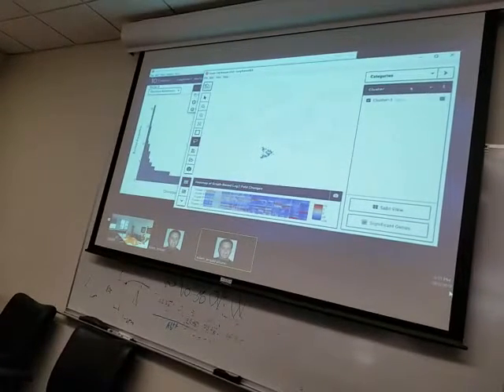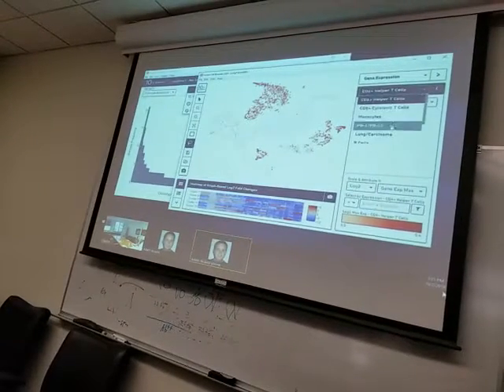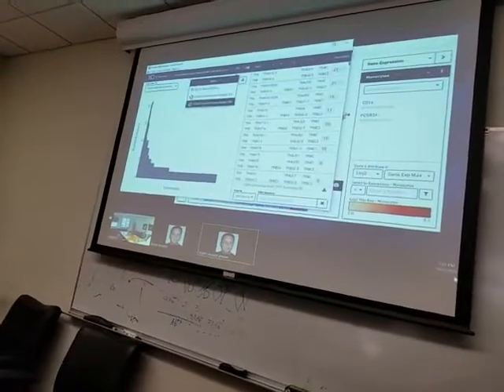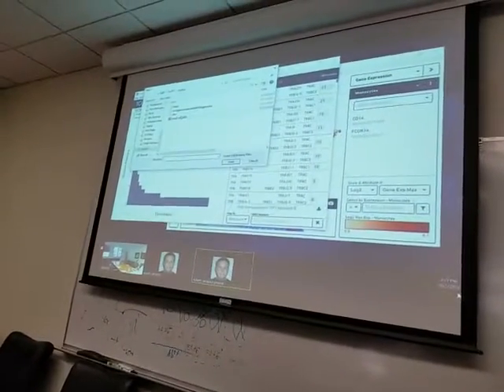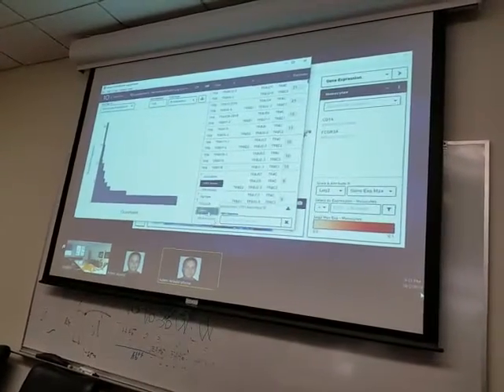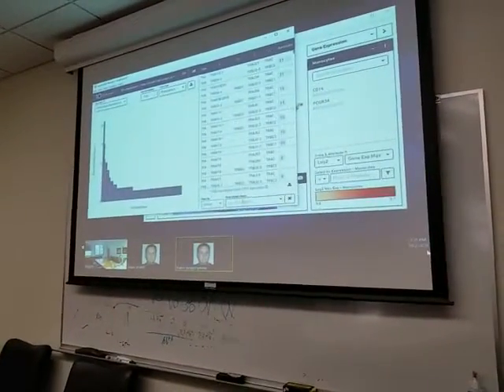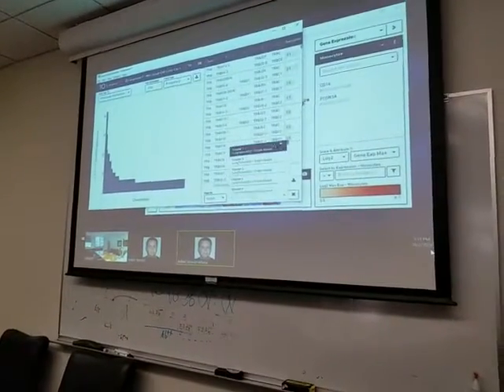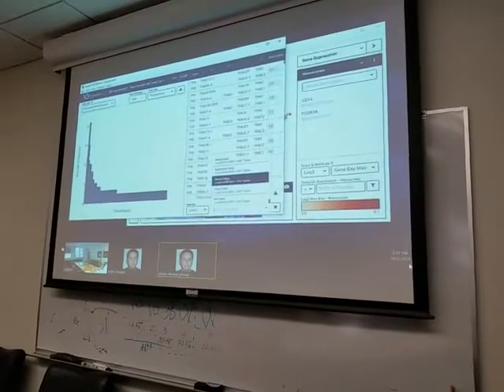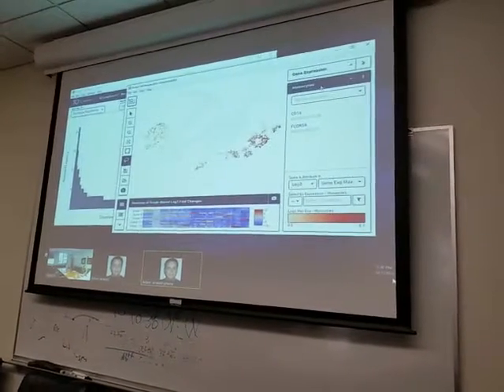Let's do it this way. Somebody's already made these categories, right? They've already identified these particular types of cells in here. So if I load in my CLoop file, now you can see this down here. One of my choices is to filter by cluster, and now I can select a different cluster type based off of what someone's already done the groundwork on, right?